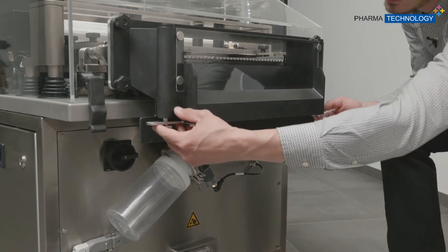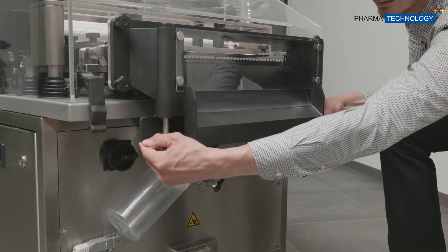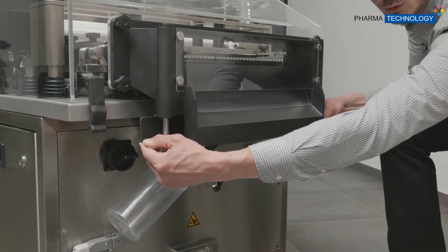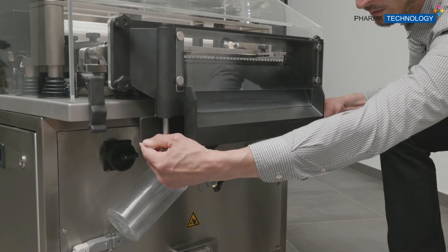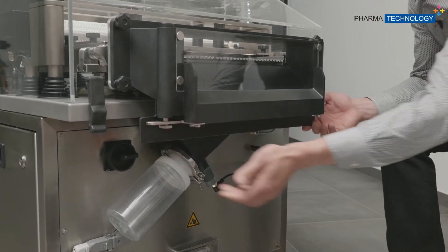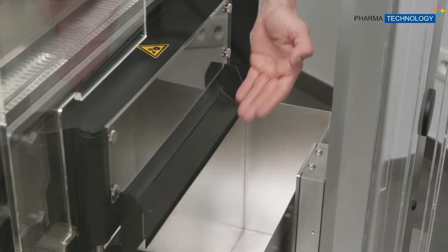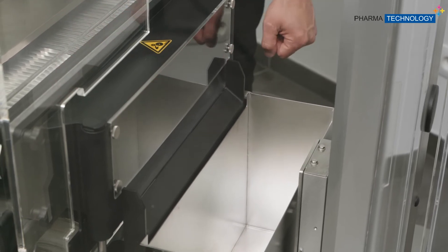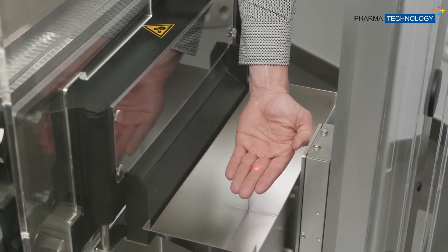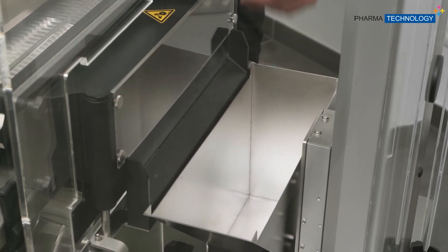During production, when the bucket of the iLift is down, this sliding door opens, allowing the tablets to go into the hopper of the iLift. When the iLift goes up, we can continue the sorting by closing the door automatically. The tablets then enter the hopper of the iLift, which is controlled by a red light sensor. When the hopper is full, it will automatically go up.